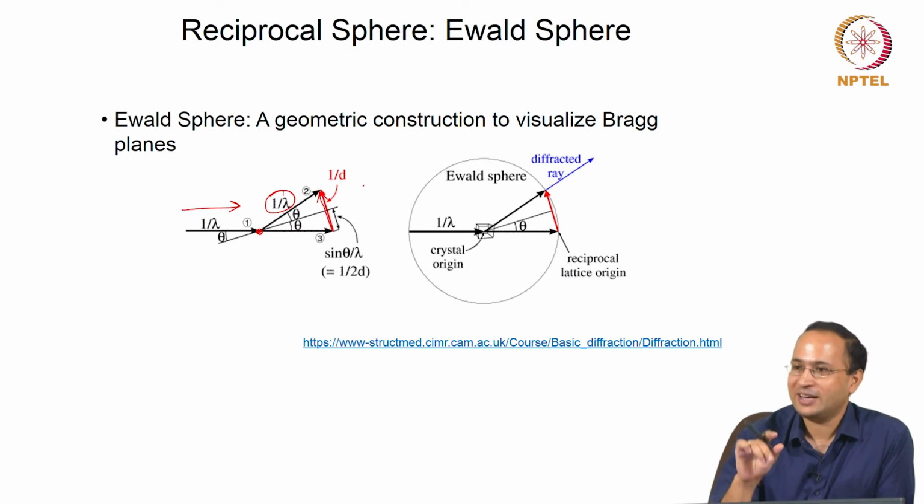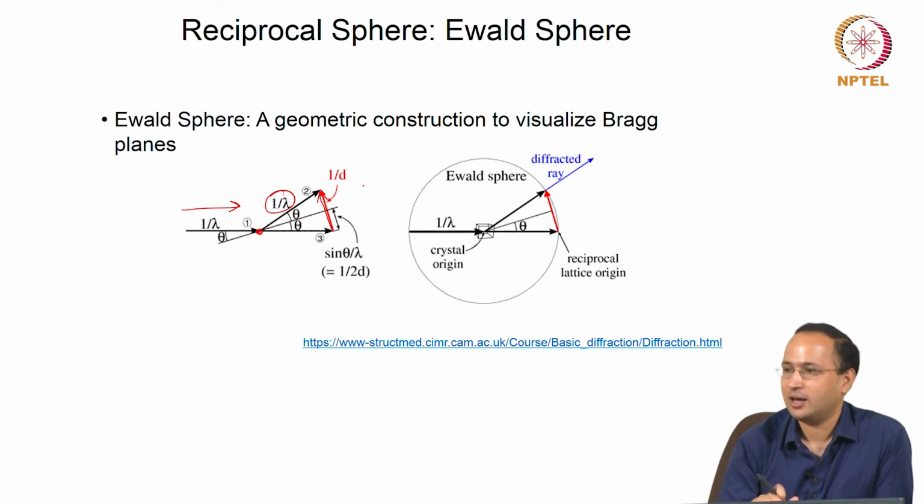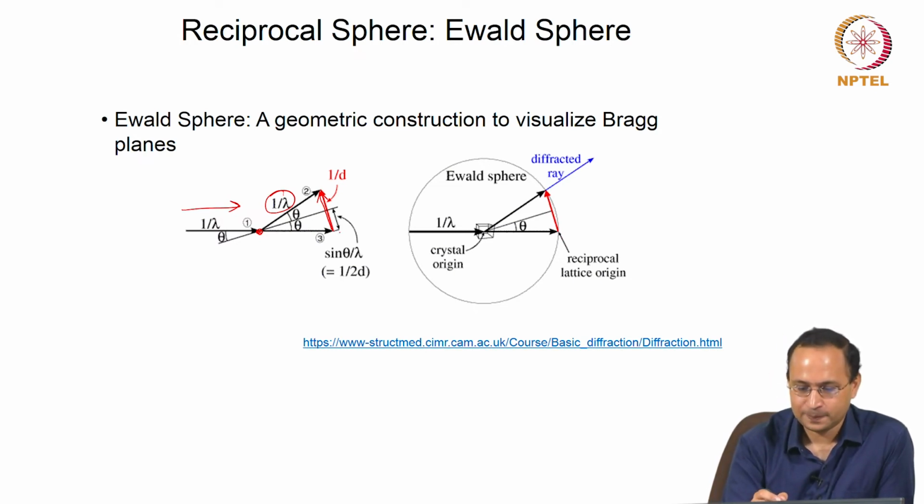We talked about yesterday that in reciprocal space, the distance of a point from the origin will be the reciprocal of the d of the normal plane. So, this is 1 over d. So, this you can write as half of it, this is 1 over 2d. Is it clear? Because it is half.